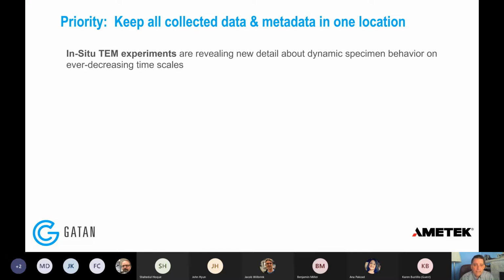So it's clear that in situ TEM experiments are growing in terms of their use, applications, and diversity. Our mantra is, one, don't drop any data. But two, we would like to be able to keep all the collected data and metadata in a single location, because then, longer term, you can query based on different experiments, different parts of the experiment. You can see what's happening in terms of temperature of the sample, or you can look at images or other data coming from it, and you can reconcile that with TEM status information that you might be pulling from the microscope.